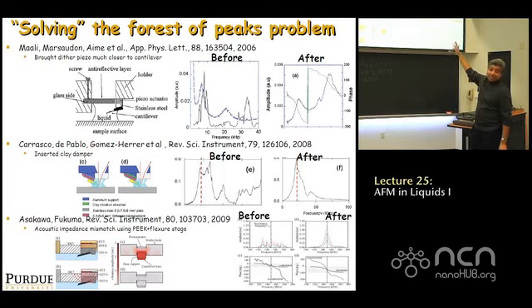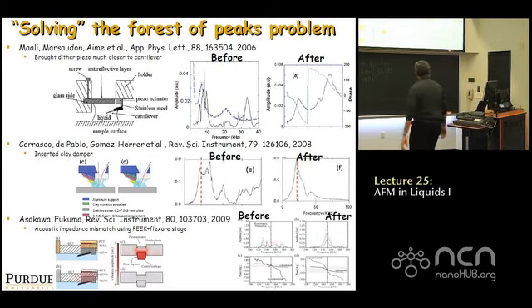Every year someone comes up with a technique to improve this, and they have a before, after image, how they've improved the forest of peaks. Unfortunately, the problem is still there, because it might work for a certain frequency range. For another cantilever, some other peaks might come up. So, the problem is not yet solved, unfortunately, and I doubt that it will.